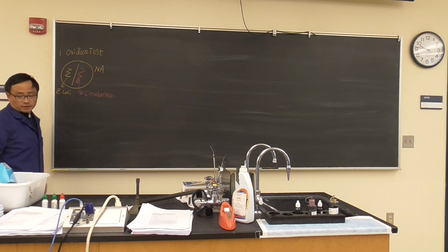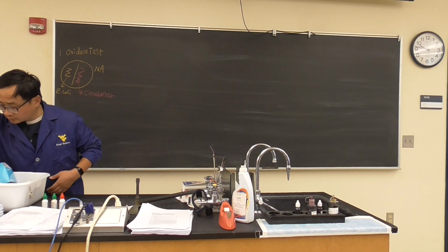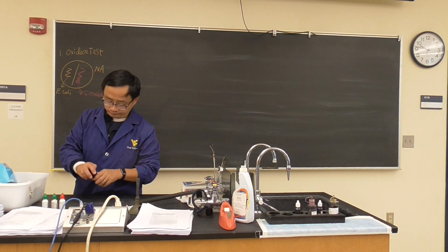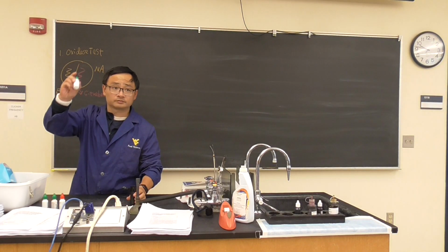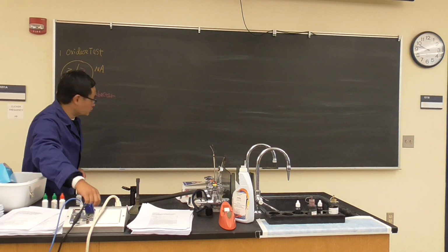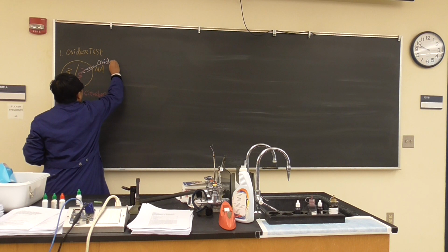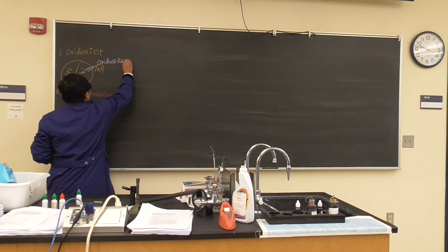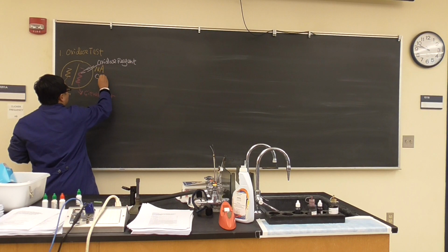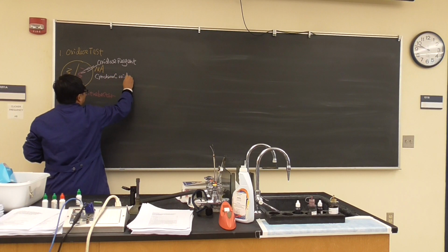Okay, what we're going to do right now? Do you have the reagent? Yeah. Okay. We got the oxidase reagent, just like this. So what we're going to do is add the oxidase reagent. And we mentioned about oxidase, it is actually what we call cytochrome C oxidase.